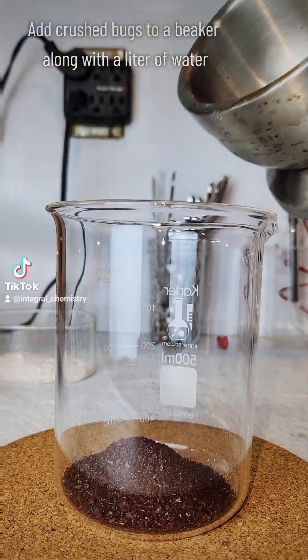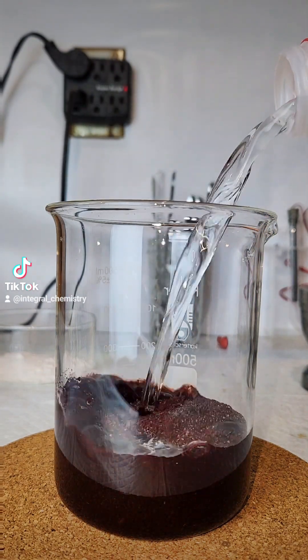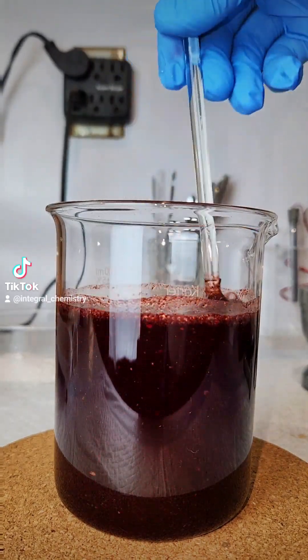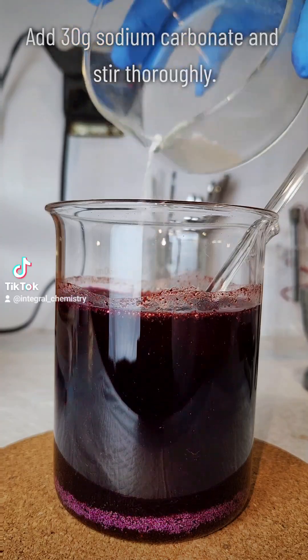To begin synthesizing the pigment I first need to grind down my bugs into as fine a powder as I can manage. This is added to a large beaker along with a liter of water and I'm going to stir it thoroughly. You can see as I stir it that the bug slurry becomes a pale red color, and that is the carminic acid dissolving in water.